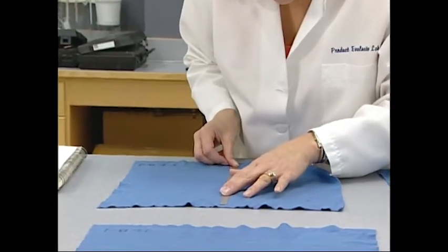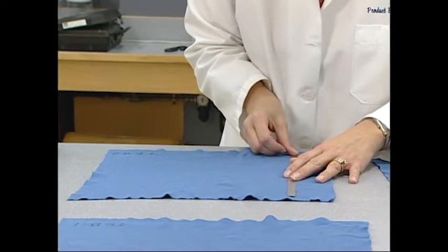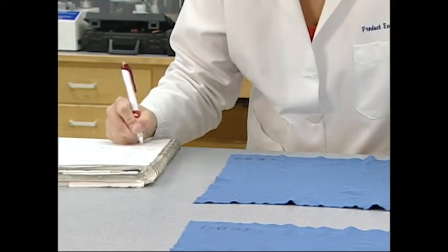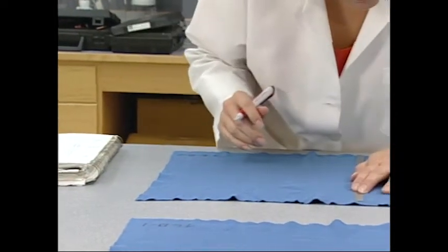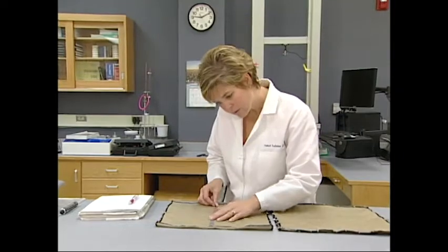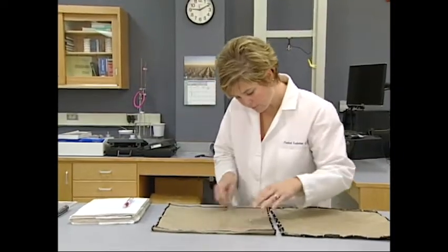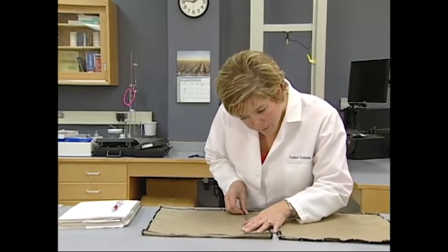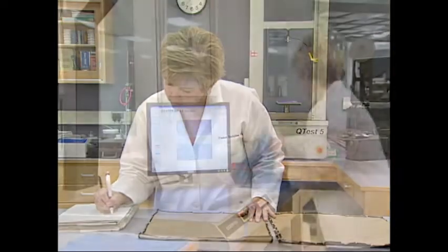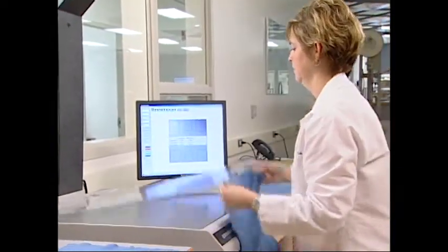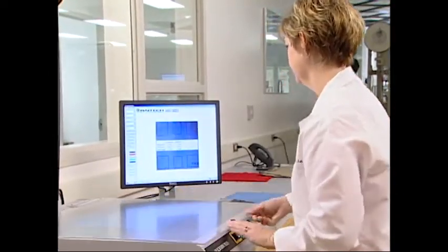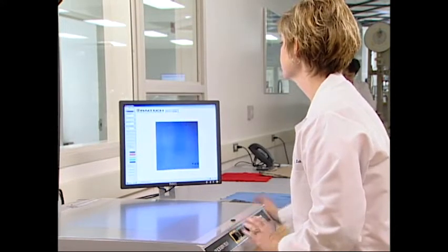Allow four hours of conditioning before measuring the benchmarks for dimensional change. Each specimen must have its benchmarks measured. In knit constructions, the length is the wale direction and the width is the course direction. In woven constructions, the length is called the warp and the width is called the filling. Record the distances as a percentage dimensional change and enter onto a tally sheet or into a spreadsheet. A digital imaging system may be used as a measuring device if its accuracy is equivalent to manual devices.